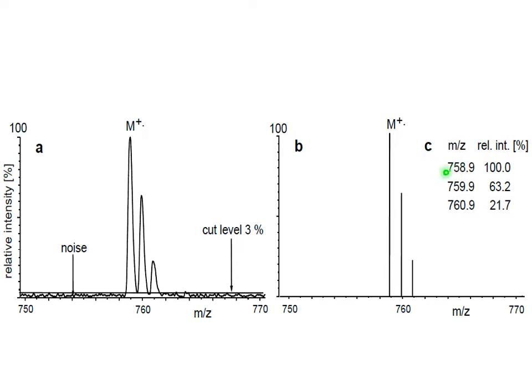Then you usually plot M to Z for each of the peaks shown. We seldom use absolute intensities. It's very difficult to measure. So most common is to use relative intensity in the group of peaks. A very common name for the peak with intensity of 100%, that is the highest, most intense peak in a group, is base peak.